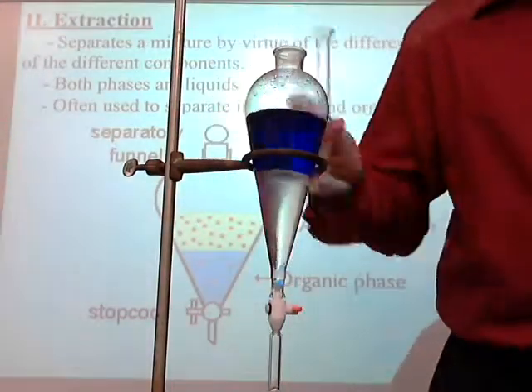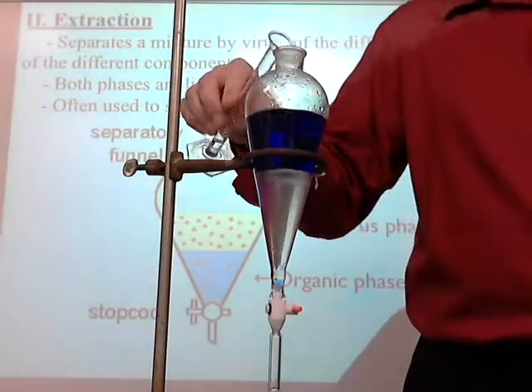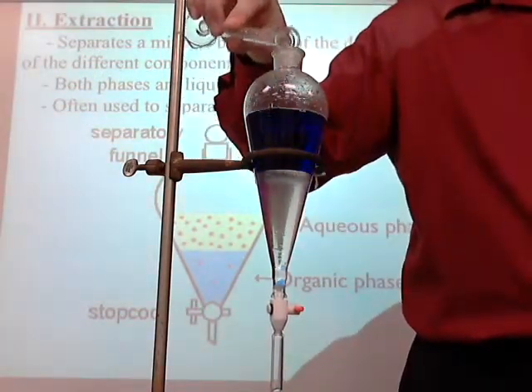It's like orange juice. And I add the hydrochloric acid. What's like orange juice? There's nothing that looks like orange juice here.